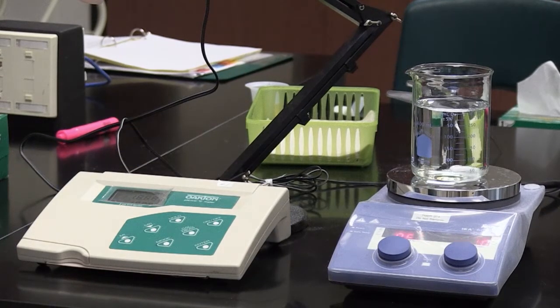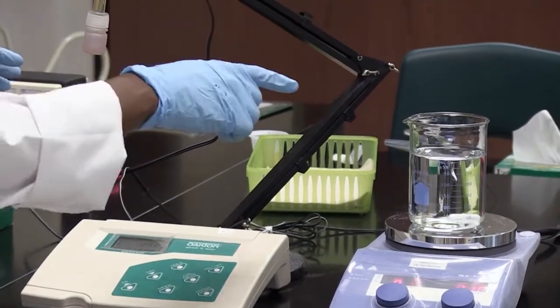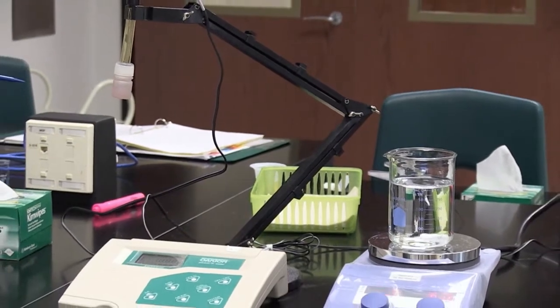So what I need to do — this is the pH electrode. This is what I'm going to place into my solution so that I can record the correct pH reading.